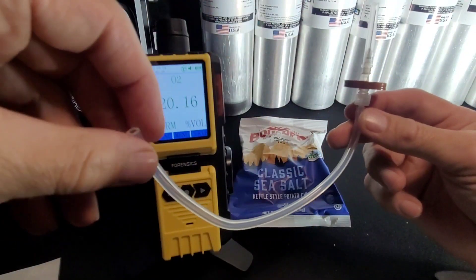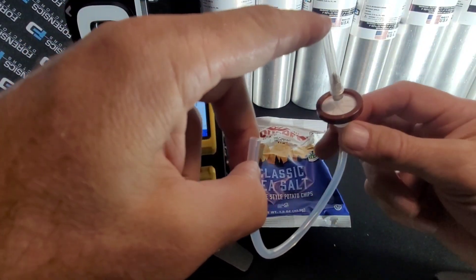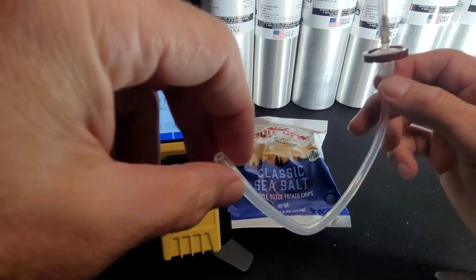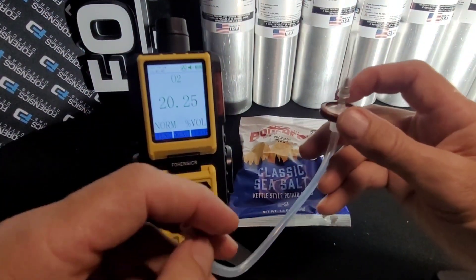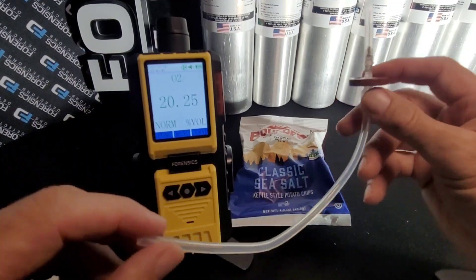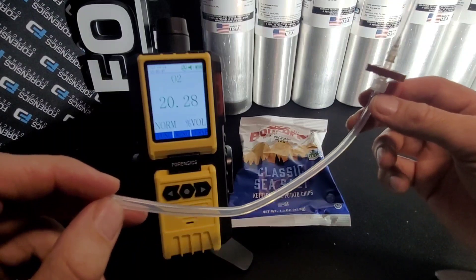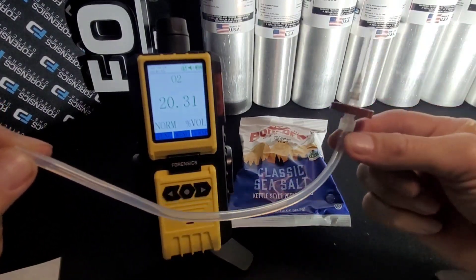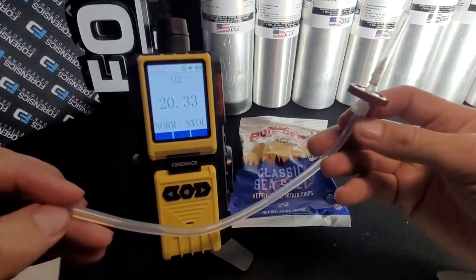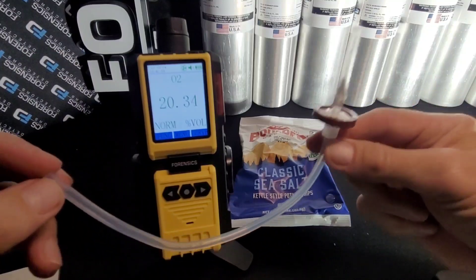I recommend each setup like this does about 100 tests. But it's very dependent on what you're testing — sometimes there are substances that have a high probability of blocking the needle and the filter. Other types, like potato chips, which is what we just tested, are a very clean product and you could go way beyond 100 tests with just one original needle setup. So just pay attention, exercise some good sense, and you should be fine.